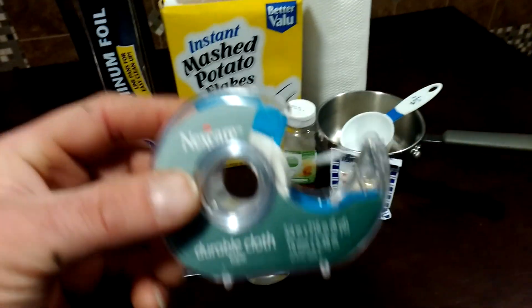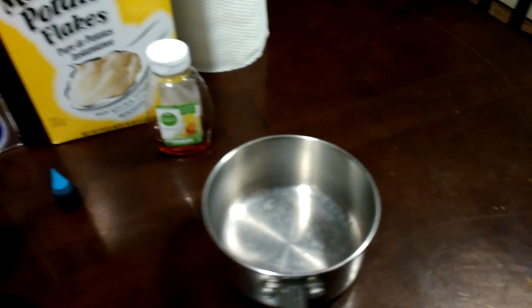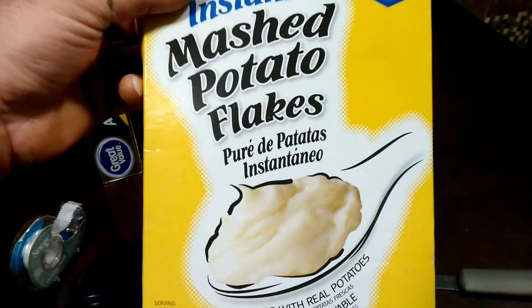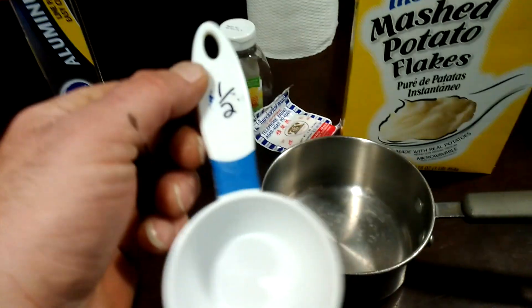It's just cloth tape. After you do all that, get you some of this agar — Telephone brand agar. One teaspoon of this agar, slap it in a pot — you're gonna cook it later on. Two teaspoons of instant potato flakes, toss it in the pot. Half a cup of water, just tap water, toss it in the pot too.